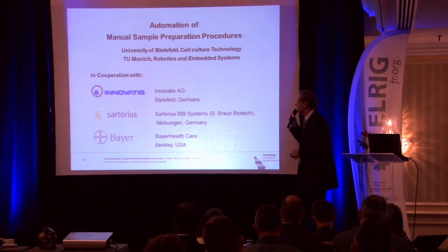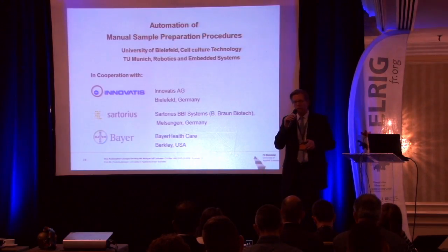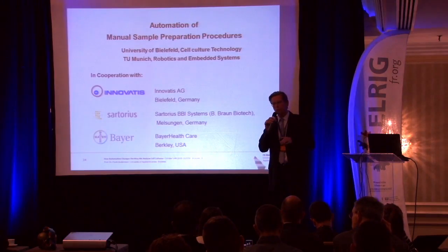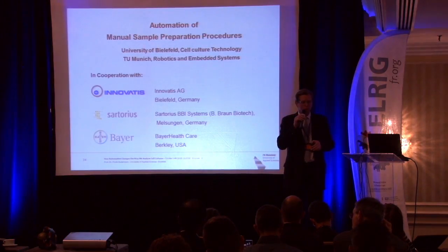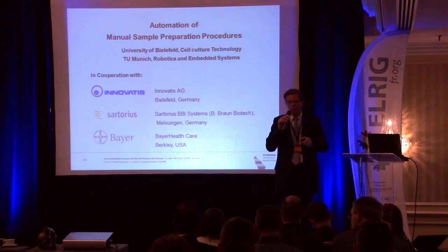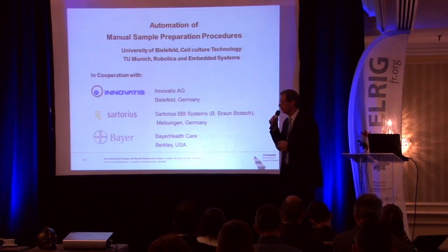And we had the idea to automate the lab work without that, with the robot using the same instruments, the same disposables as we do as human beings in the lab. So that would mean that the robot needs to find a centrifuge. Even if it's moved by half a meter, it has to find a rack of sample cups on the lab bench, even if it has moved about 10, 15, 20 centimeters.